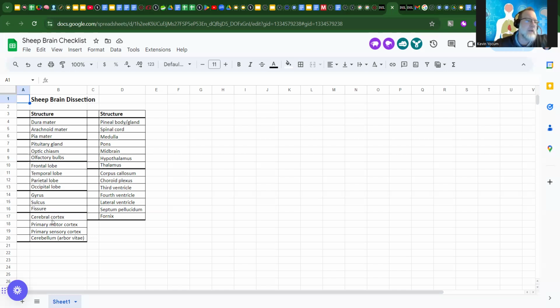So anyway, a couple more items that we'll be seeing in these areas: the cerebral cortex, or cortices is the plural, and then we'll look at the primary motor and primary sensory cortices as well, and we'll also be able to distinguish those with some landmarks. There'll be some sulci, fissure, and gyrus landmarks that'll help us to distinguish the primary motor and primary sensory cortices. And then we'll also be using some of these as landmarks as well, the frontal, parietal, and temporal lobes.